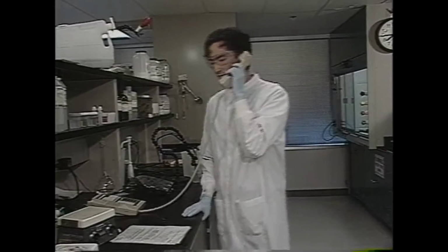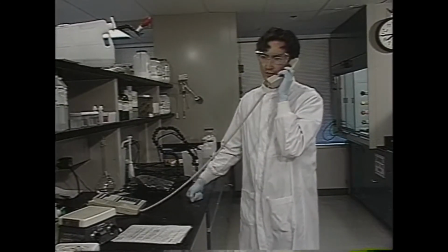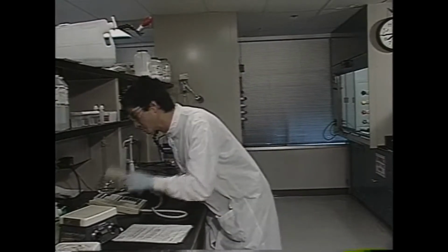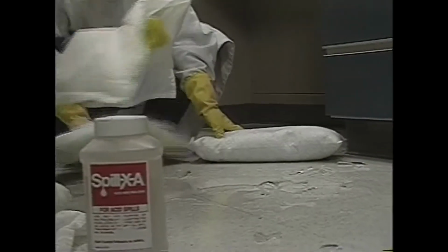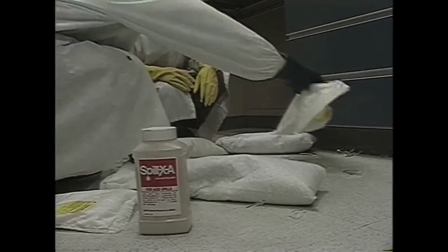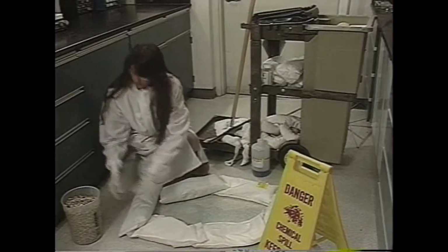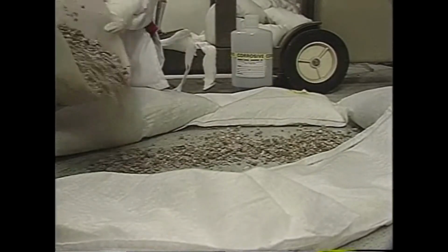Then, notify the appropriate personnel. Depending on how serious the situation is, this may be your supervisor, your facility's chemical hygiene officer, or an outside hazmat response team. If it's a spill or leak that you can handle yourself, work to contain it. Use an absorbent pillow or neutral material to create a barrier around the chemical. Then, clean it up.